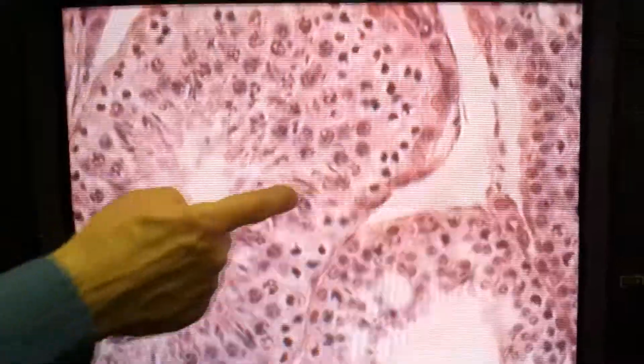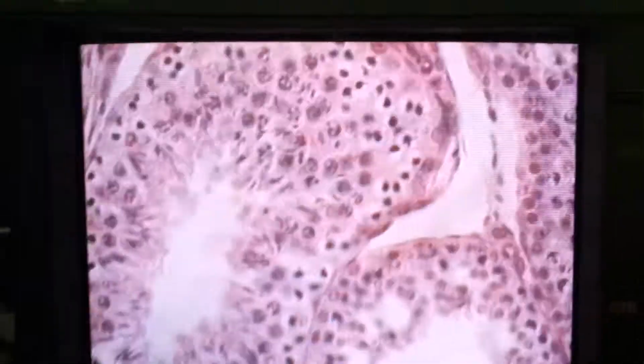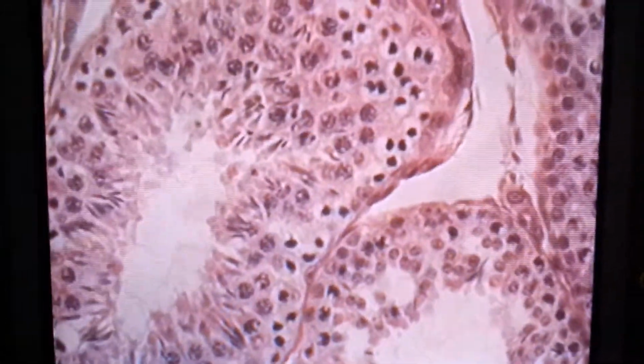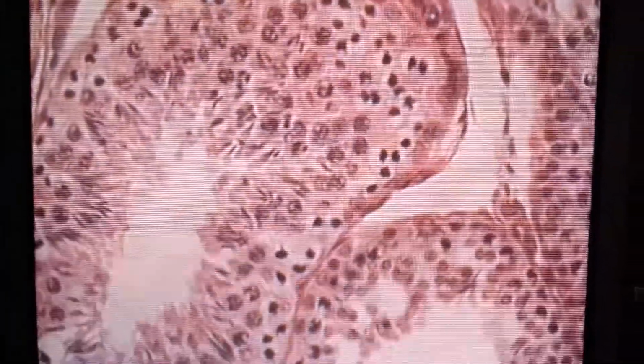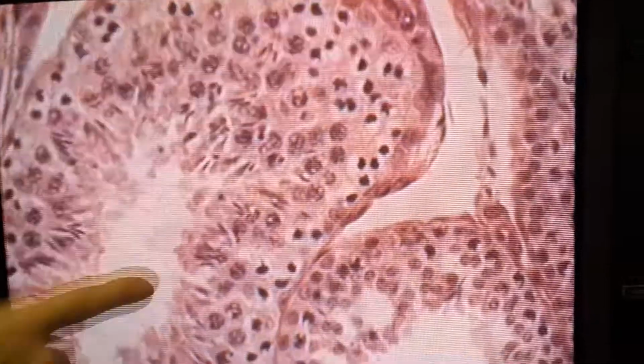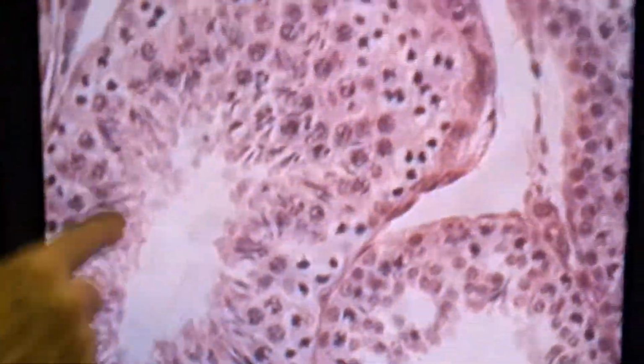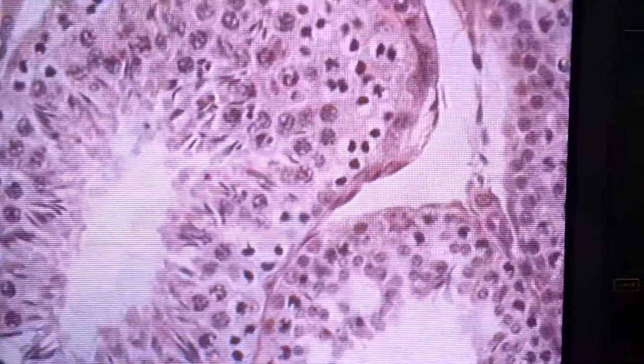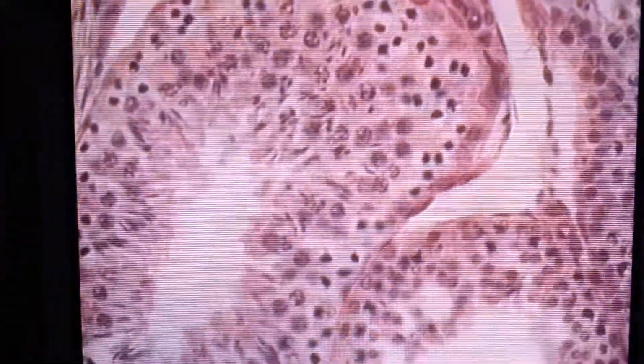Well, you don't usually see them together, so these are all primaries, a lot of them, right? The primary spermatocytes are those big cells, filled with chromosomes, very obvious, the largest ones. And these are mature sperm. Can you differentiate between secondary and spermatids? Spermatids are pretty clear also.